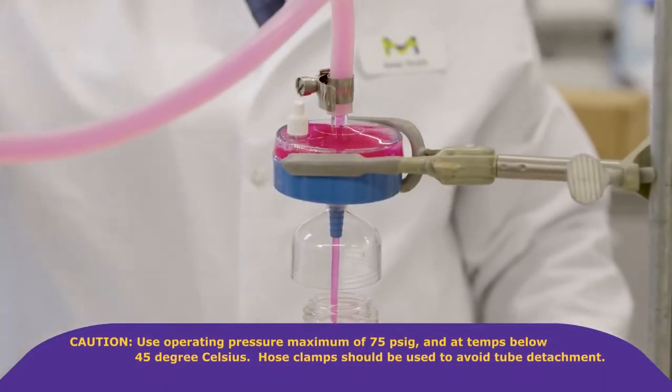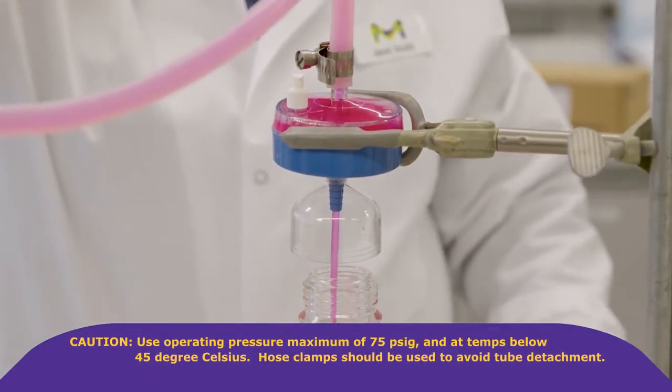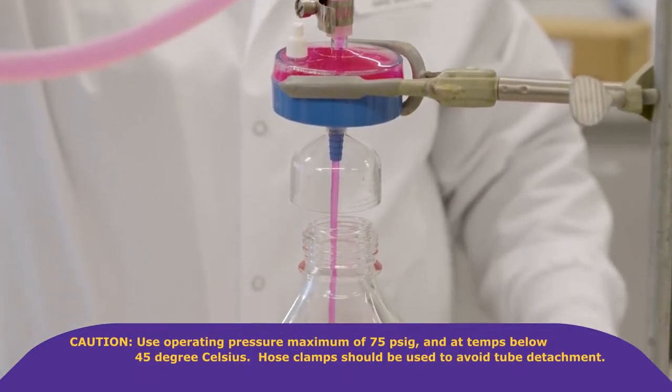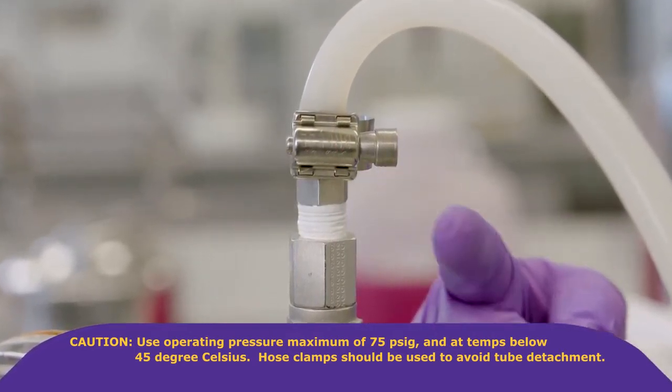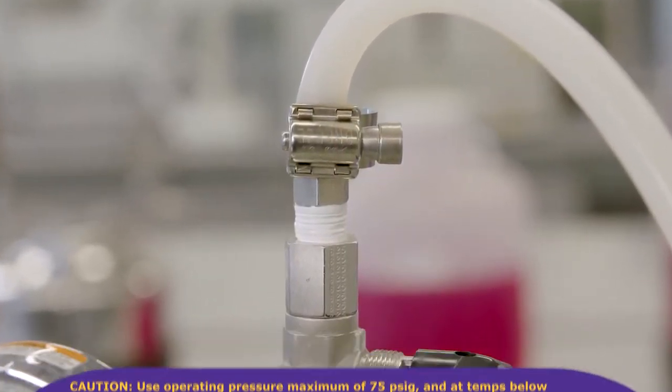Cautions: use operating pressure maximums of 75 psig and at temps below 45 degrees Celsius. Hose clamps should be used to avoid tube detachment.